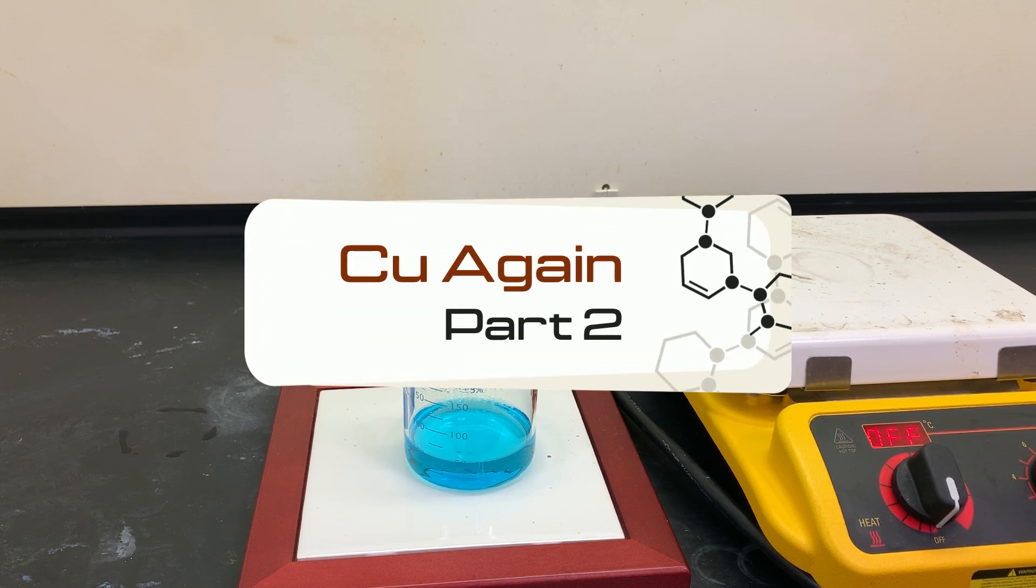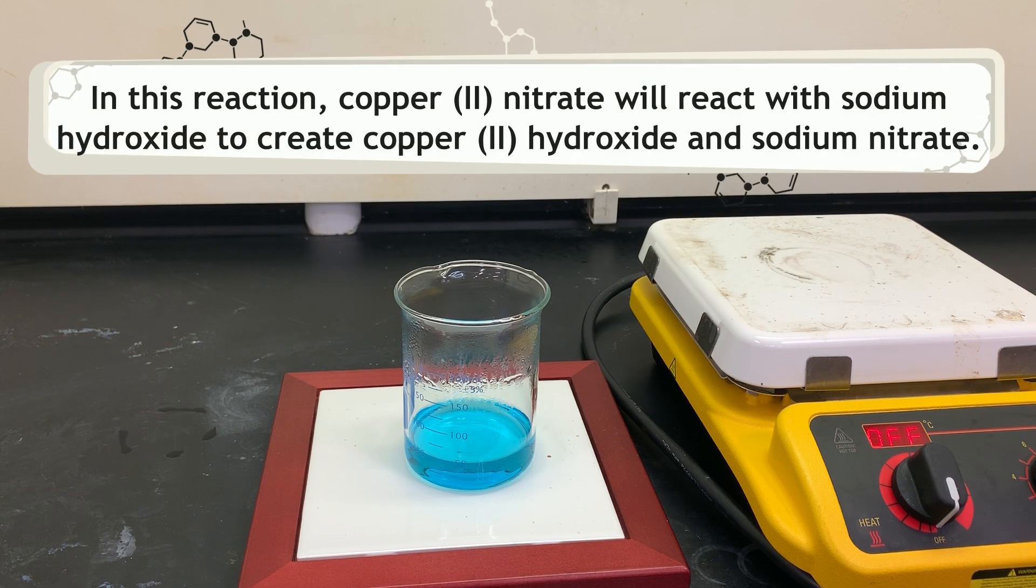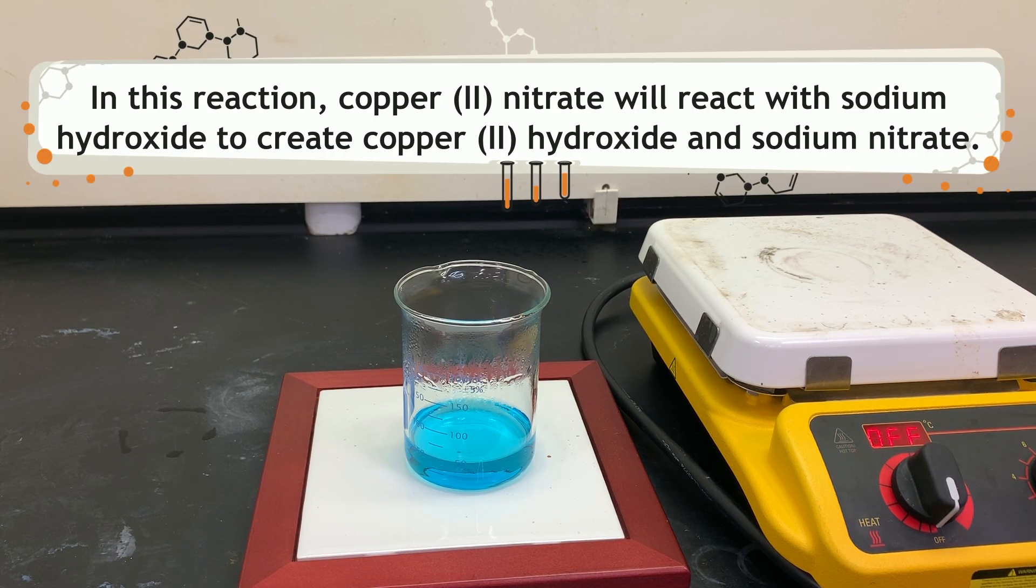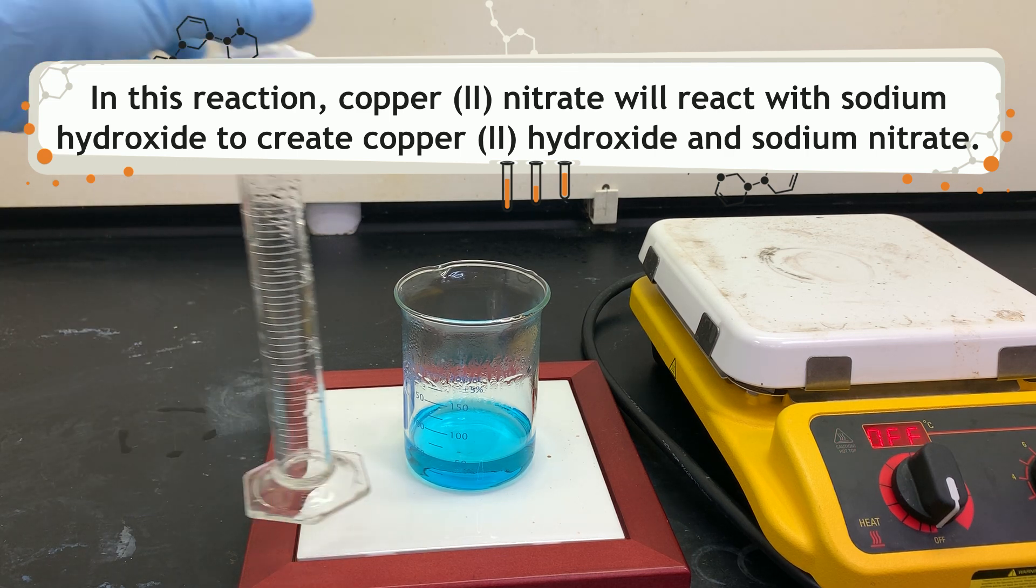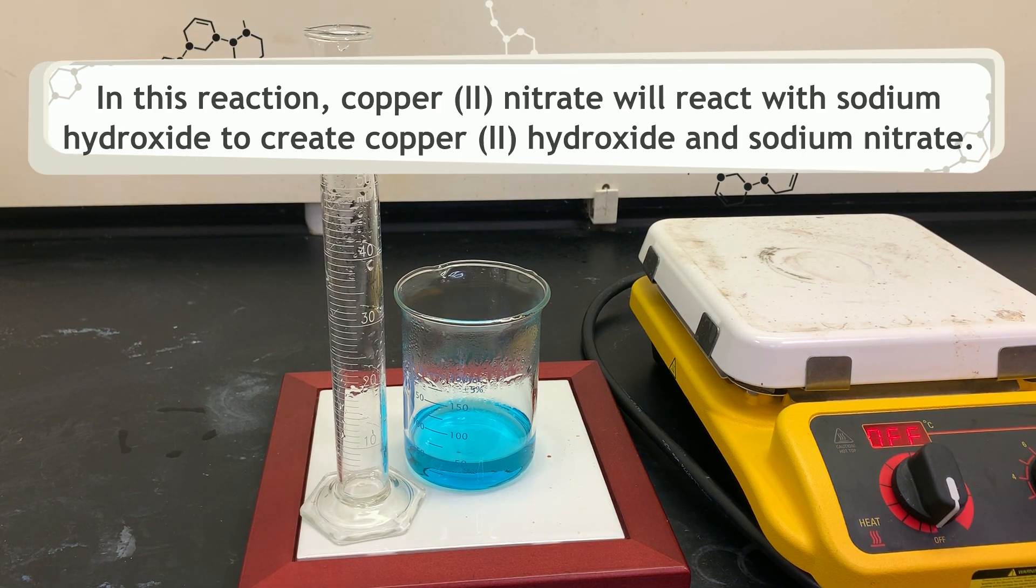Okay, this is part two of the reaction sequence. In this part, we are going to take the copper nitrate from the previous reaction and react it with sodium hydroxide to create copper hydroxide and sodium nitrate.